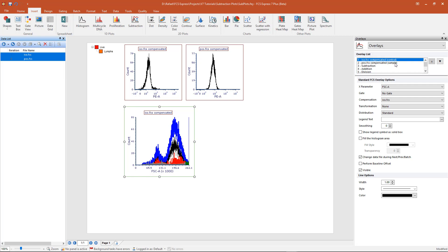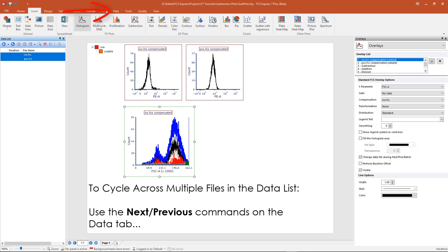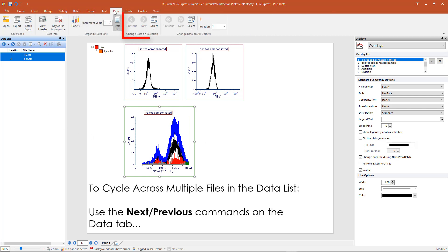If multiple files are loaded into the data list, you can cycle through each pair of files using the next and previous commands in the data tab.